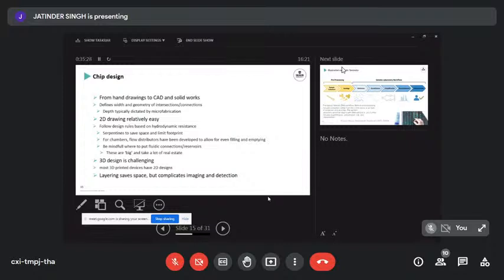For chambers, it is important to think how they're being filled and emptied. A square chamber with an inlet and an outlet, you always get dead corners. So there's nice designs out in the literature of flow distributors, which a channel splits out as kind of a range of different fingers to fill a chamber from different filling points. Then again, at the outlet, it does the same. So it gets much smoother flow, much more homogeneous flow around the chamber.